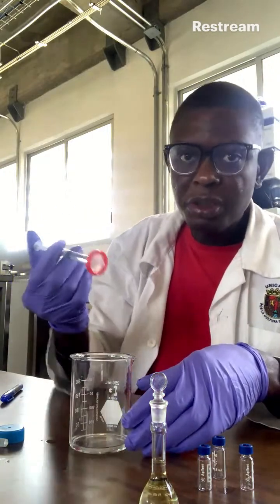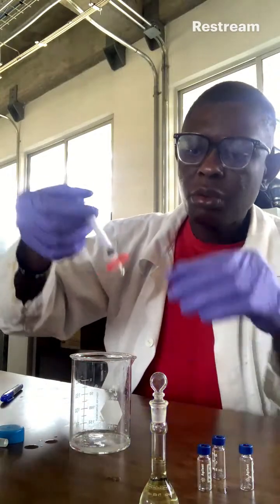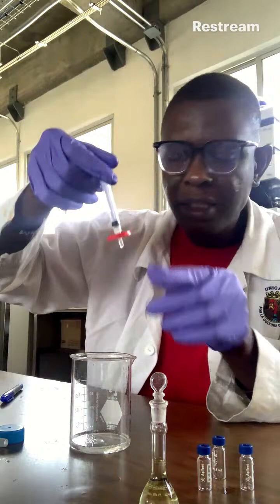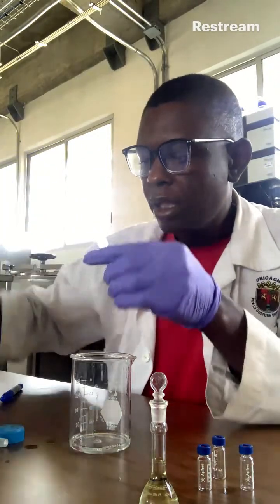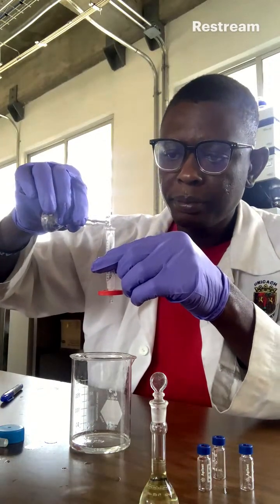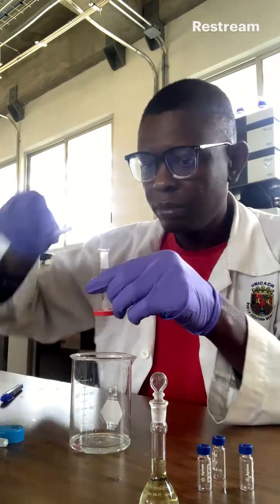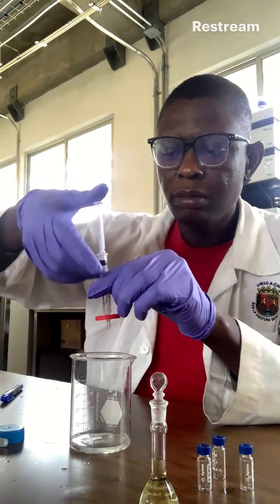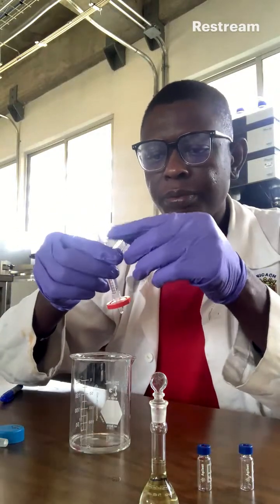So I'll use it to wash my syringe. I'm doing this so that I can wash out the particles from this other sample so it will not get contaminated. So now I'll pour in my banana, and then I'll put it in this bottle.